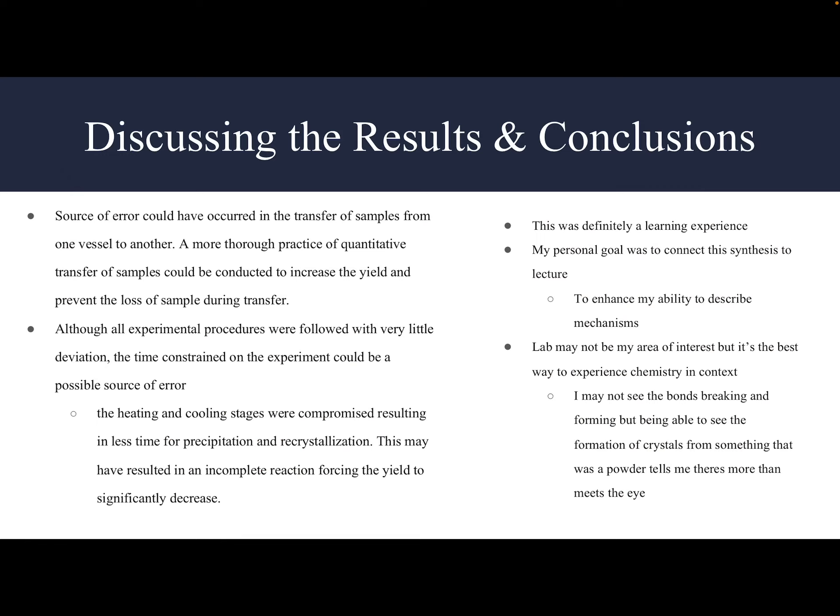Discussing the results and sources of error: I can see why our theoretical yield and observed quantity were so different. One source of error was in the transfer of samples from one vessel to another — there was a lot of moving material onto a watch glass and back into a tube, especially during the recrystallization step, as well as having excess water. To address this, a more thorough practice of quantitative sample transfer could be conducted to increase yield and prevent loss of sample during transferring.